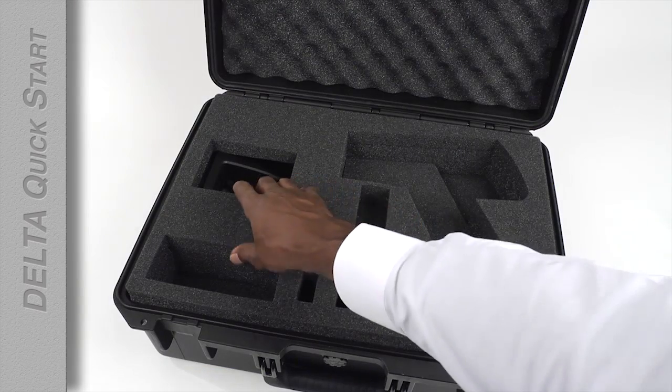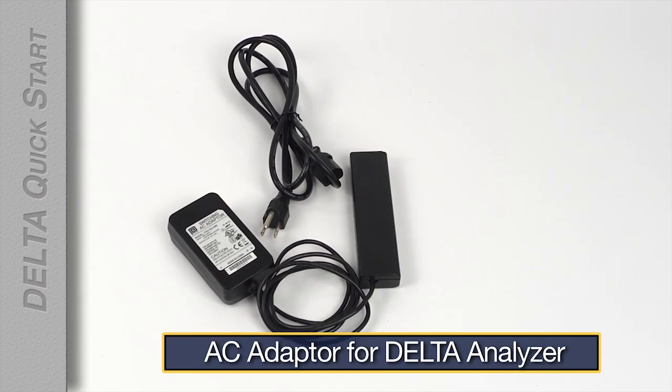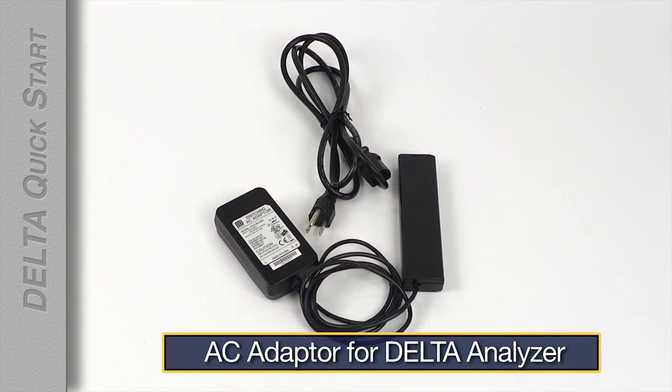Underneath the first layer of protective foam you'll find the docking station and the AC adapter for the analyzer if you bought one.